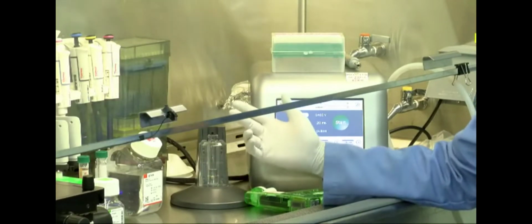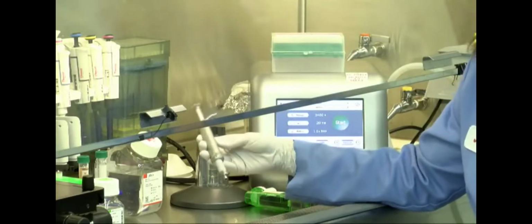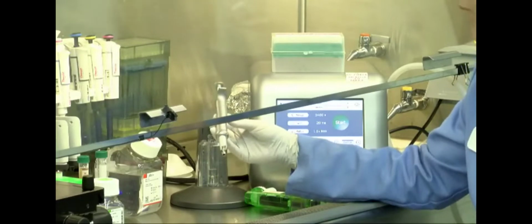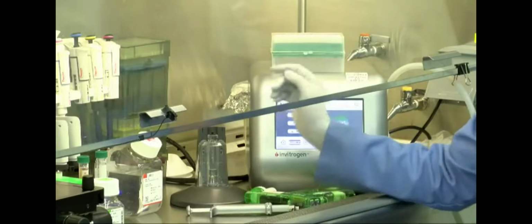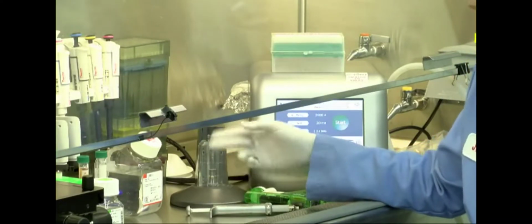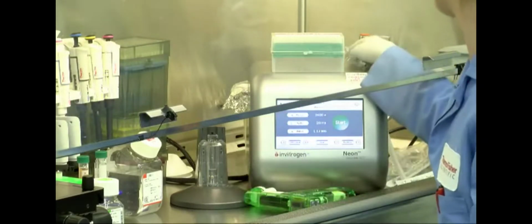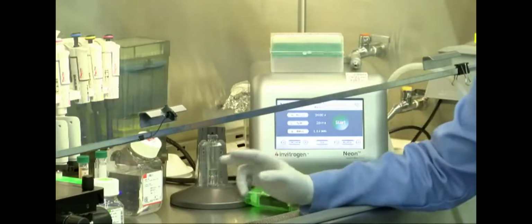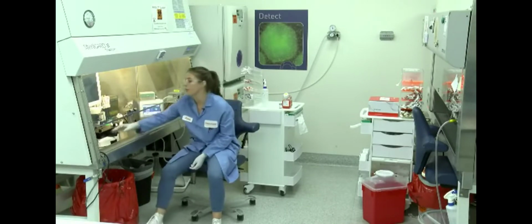The third piece is the Neon pipette, and this is a fixed volume pipetter, designed specifically for the Neon tips. When you're ready to transfect, you load the entire pipette into the Neon pipette station for the transfection. Our cells should be done dissociating soon, so you can now prepare the plate that you will be putting the electroporated cells into.